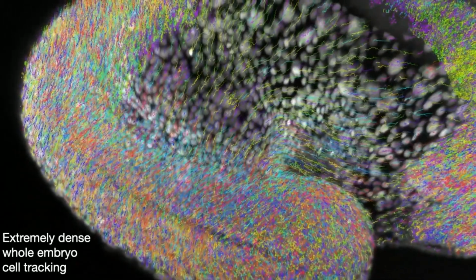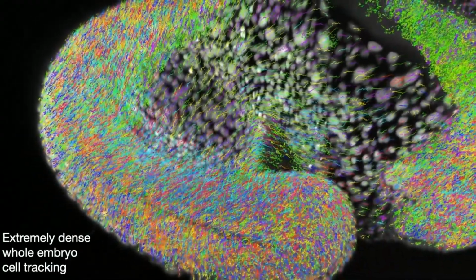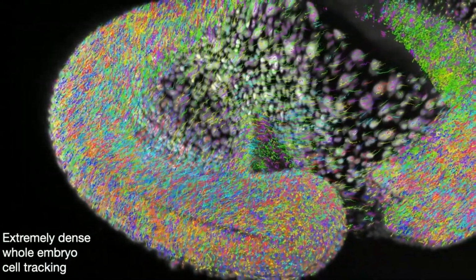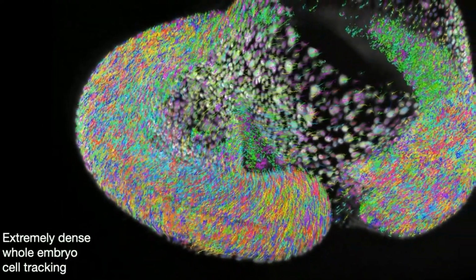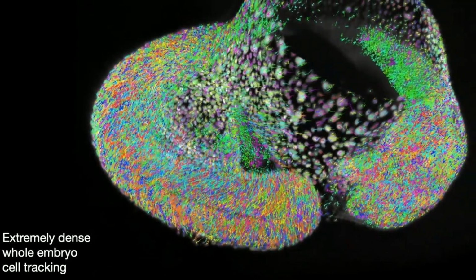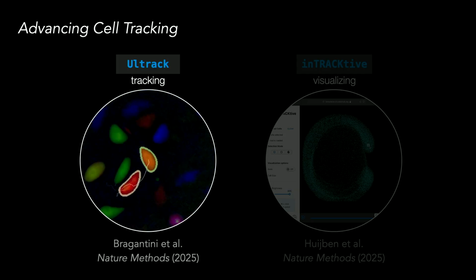So we can do this now simultaneously for all 10,000 plus cells in the embryo, and basically fully map out how they all go their way during development. So where do they go, where do they come from, when do they divide, etc. So this gives us a very rich data set to study these dynamics in these first crucial hours of development. So that's the tracking part, ULTRAC.